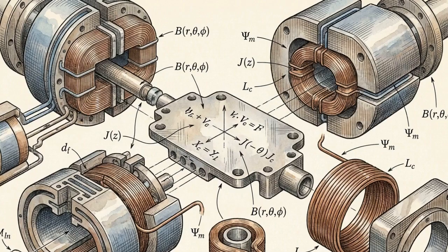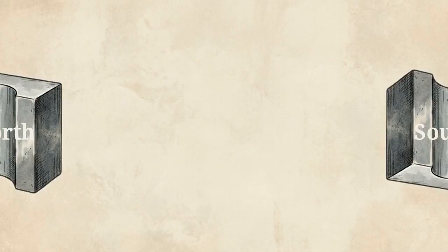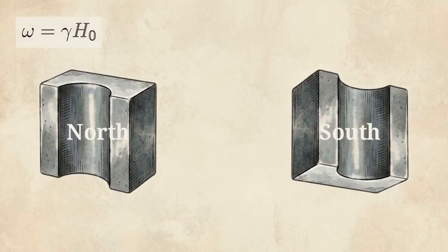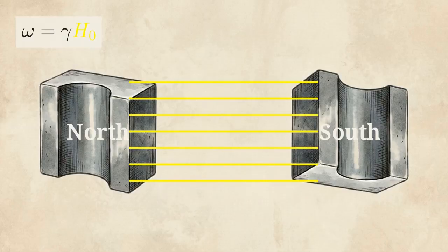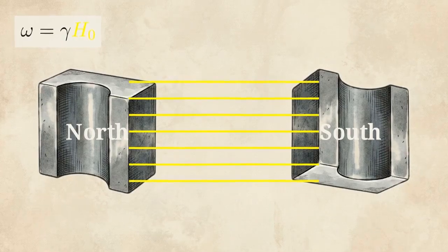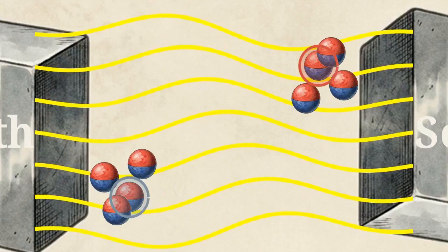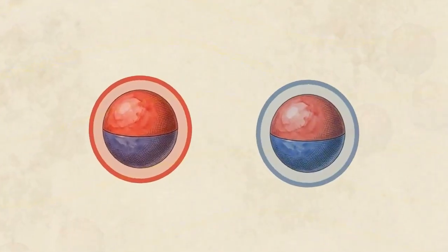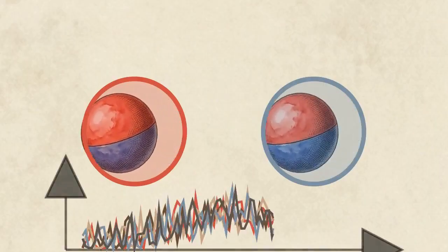The entire engineering challenge of NMR is simply designing hardware capable of measuring this precise precessional frequency, because that frequency contains the exact chemical environment of the atom. Our first hardware requirement is the main magnet. To control the right side of the Larmor equation, we need to generate an intensely stable and perfectly homogeneous magnetic field across our sample. If the field is uneven, the system fails catastrophically. Nuclei in the top corner of the sample would experience a slightly different field strength than nuclei in the bottom corner. According to our equation, they would precess at slightly different frequencies, producing a smeared, unreadable signal.